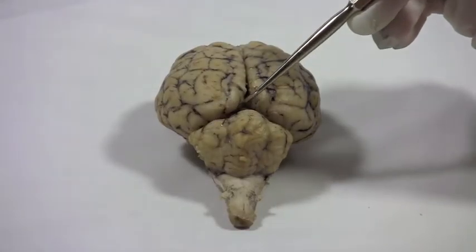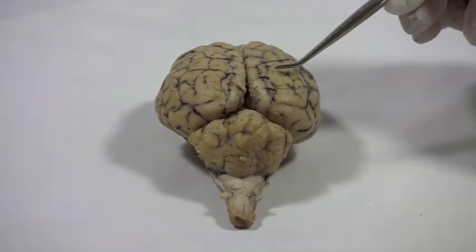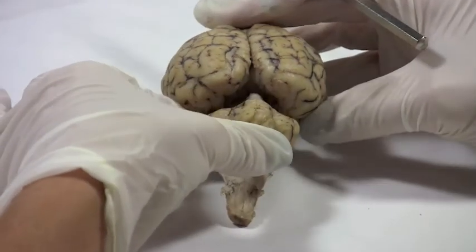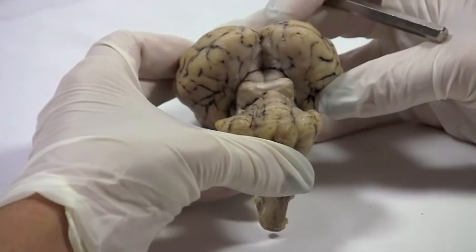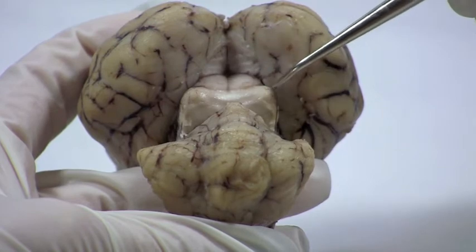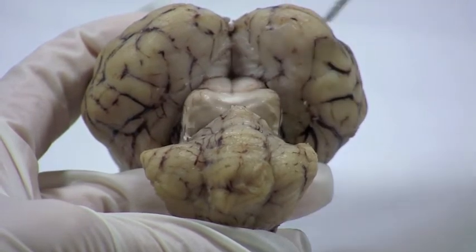Let's look into the transverse fissure, which is in between the cerebrum and the cerebellum. These four bumps make up the dorsal surface of the midbrain. This area is called the corpora quadrigemina.